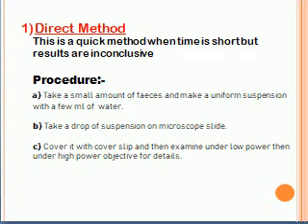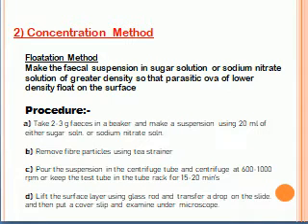The procedure is, we have to take a small amount of feces and make a uniform suspension with a few ml of water. Then we take a drop of the suspension on a microscope slide and cover it with a cover slip, and then examine under low power and then under high power objective for details.